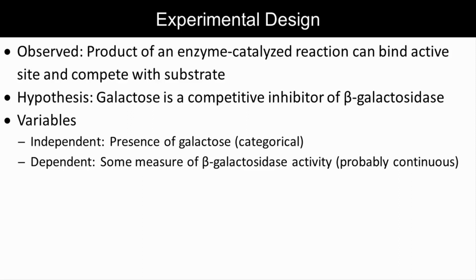My null hypothesis is that galactose has no effect on beta-galactosidase. Pause here and think about how you could set up an experiment to test this.